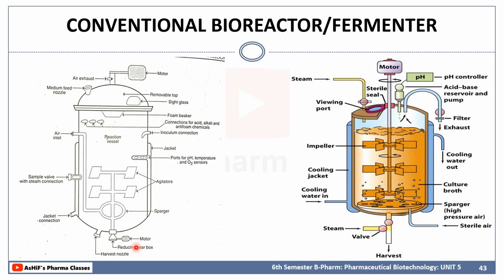Because it will avoid the accumulation of any kind of products, and it will be very easy to clean the fermenter.